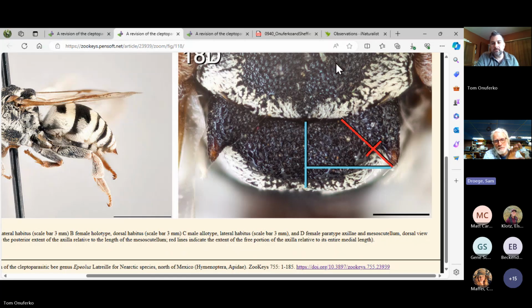You can see some of the ambiguity, which is always true for all these taxonomic keys. I might look at that and say, well, the tip is a little bit hooked. You know what I mean? But the side is straight. That's why it's supposed to be multiple pathways. It's supposed to be somewhat hooked in this species. That's fine. It doesn't key to the same place as scutularis. It's in the first half of the couplet.